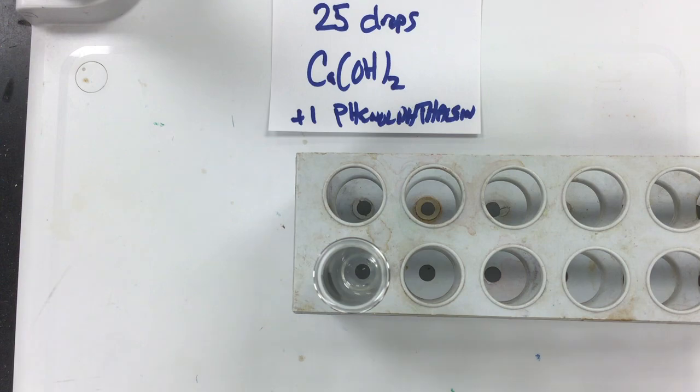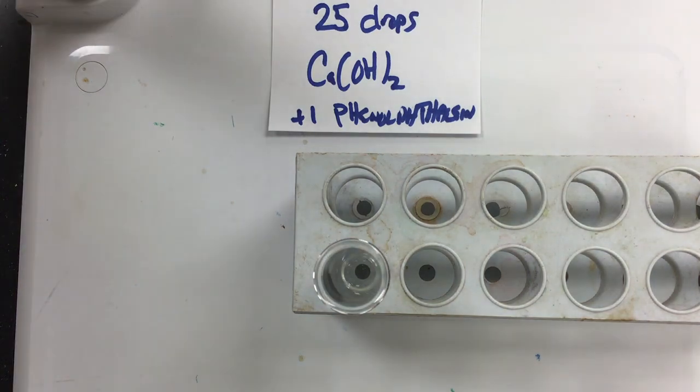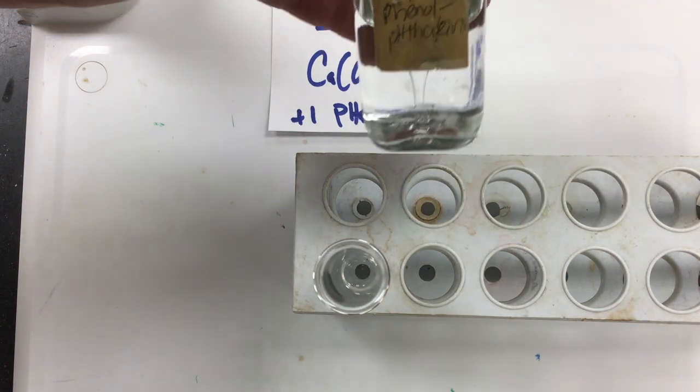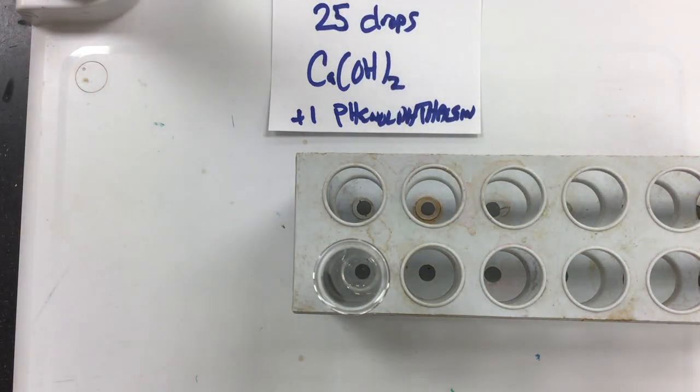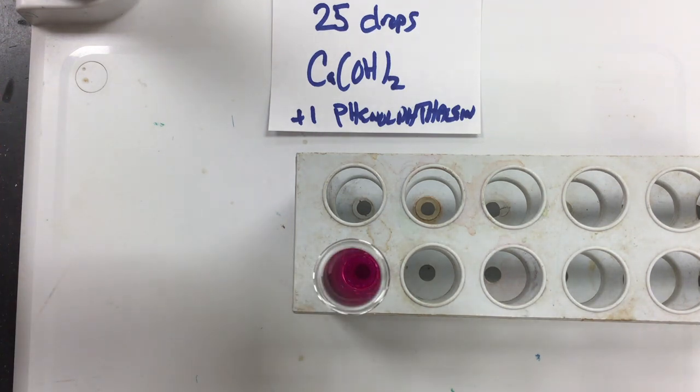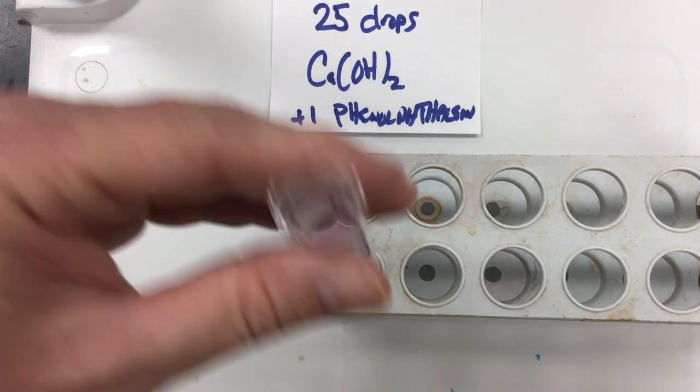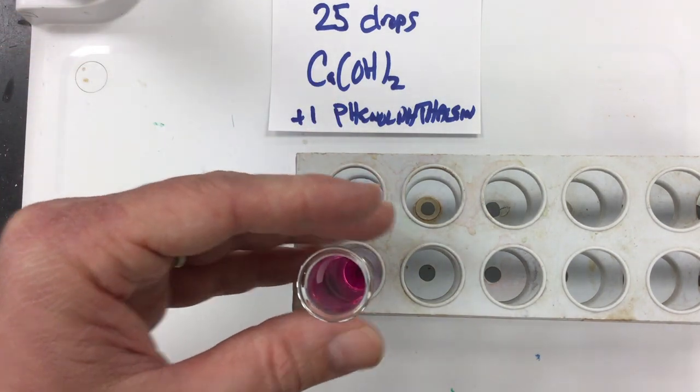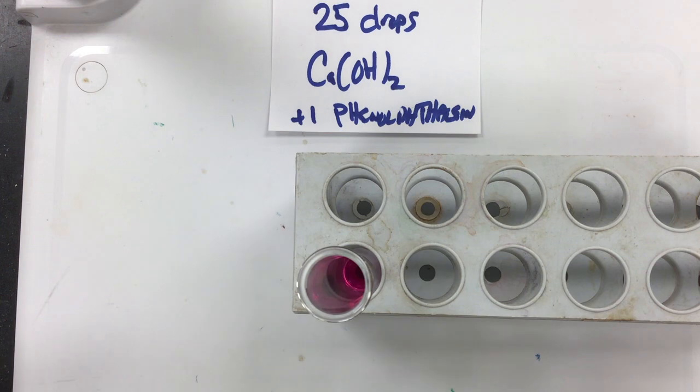And what I'm going to do is I'm going to verify that this stuff actually is basic by using phenolphthalein. Now if you remember, phenolphthalein here is an acid-base indicator. And maybe you remember what color phenolphthalein turns in a base. I'll give you a moment to make a prediction about that. So make a quick prediction. I'm going to add one drop of it in there. So if I add one drop of that, sure enough it turns pink.